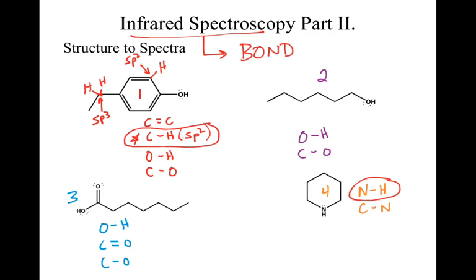The primary issue with that is that if we have an NH that's secondary, meaning it's attached to 2 carbons, we only get 1 peak, very similar to an OH. So while the NH signal would be a good thing to use to pick out away from the rest of these structures, it becomes a little bit more challenging because it looks similar to the OH. Really what we're trying to say is the NH is going to be different if you read more about them. They're a little bit less intense than the alcohol. So we could look for a signal that looks similar to the alcohol, but much, much less intense. So that could potentially help us identify that structure.